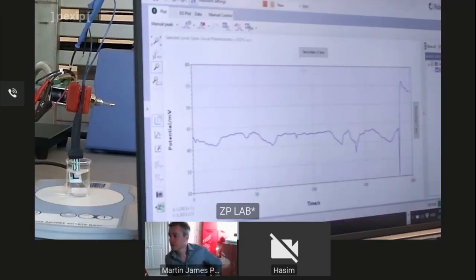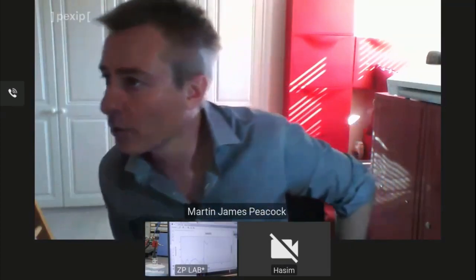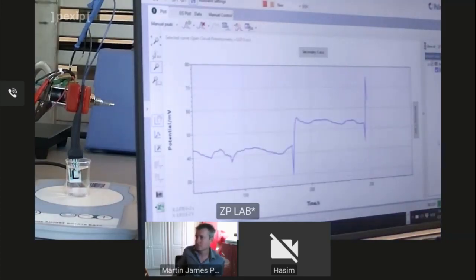A step in concentration. No, we see it fine, Andre. We see your noisy baseline. Then you put the sodium in there, and then it jumped up. Yeah, that's correct. So what we did was a step from 40 millimolar to 80 millimolar, so a 40 millimolar step. What I'm going to do now is give another step and try to change to 160 millimolar. The stirring will also add some noise to the test. So when I pipetted, now we saw another step. According to the Nernst equation, this is a logarithmic scale. So now we did a 40 millimolar step and then an 80 millimolar step.